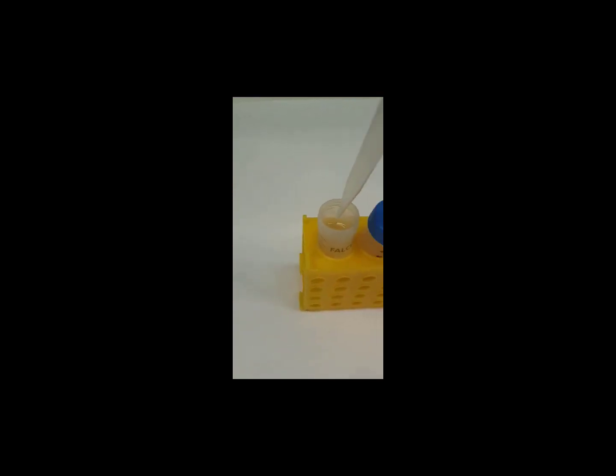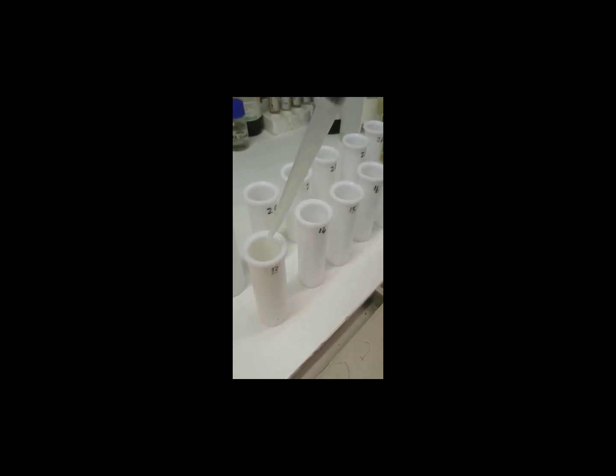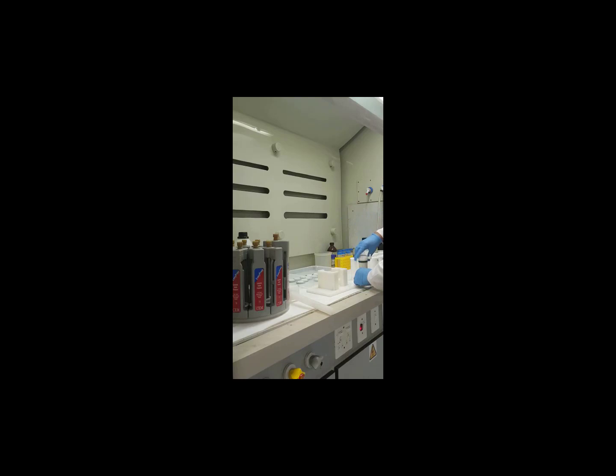6 milliliters of ultra-pure nitric acid and 1 milliliter of hydrogen peroxide is then added to each vessel. Samples are digested in a 12-place carousel where a blank and certified reference material is digested along with the samples. Samples are closed with a Teflon cap and left to pre-digest for 30 minutes. Each vessel is inserted into individual heat protective sleeves before placing it into the carousel.